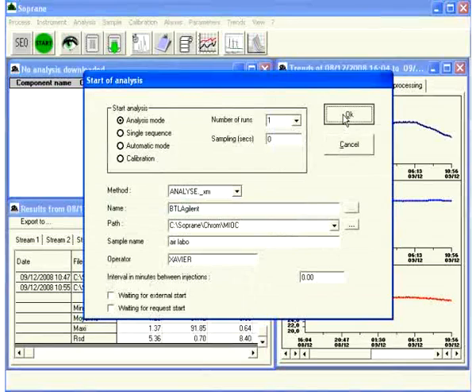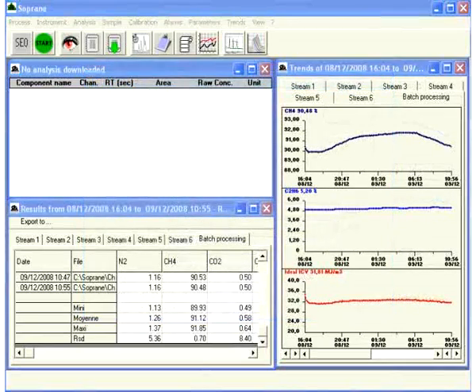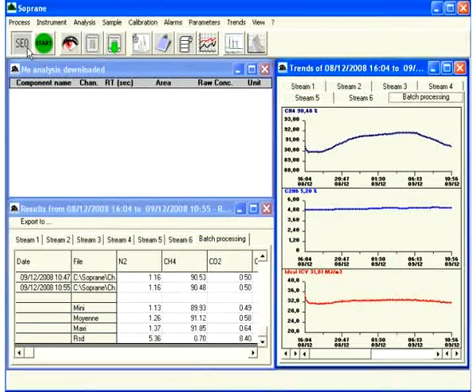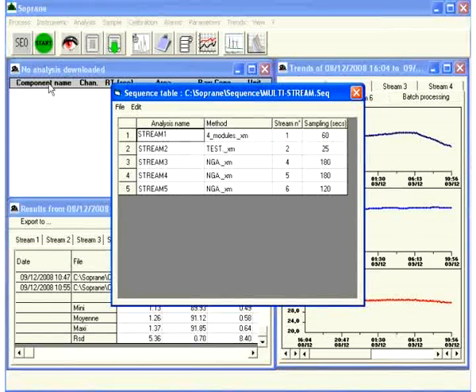Develop methods easily. Single screen functional overview for analysis settings and results.